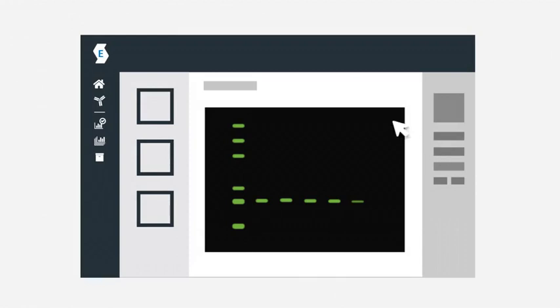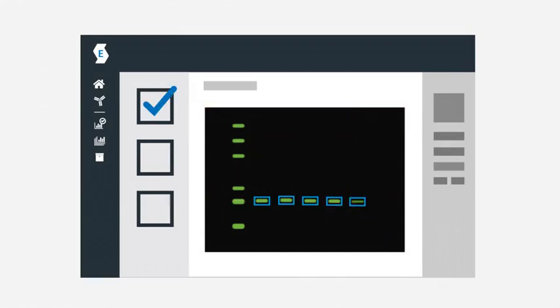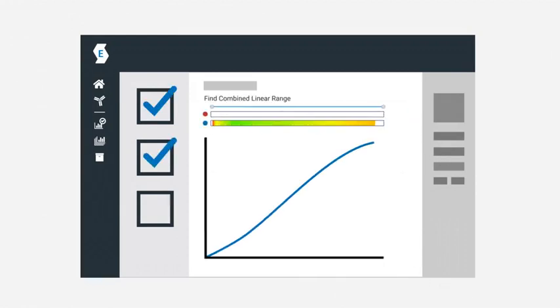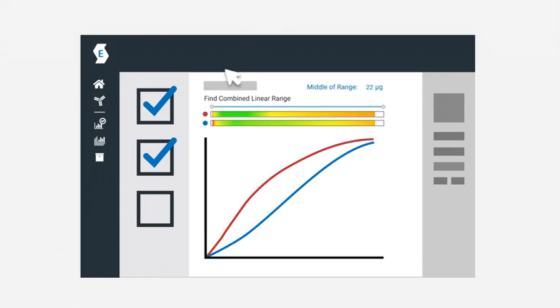To begin, workflows for analyzing publisher-recommended validation experiments provide the supporting data you need to be confident that your experimental design is robust.